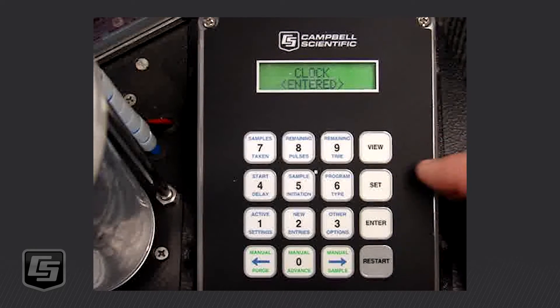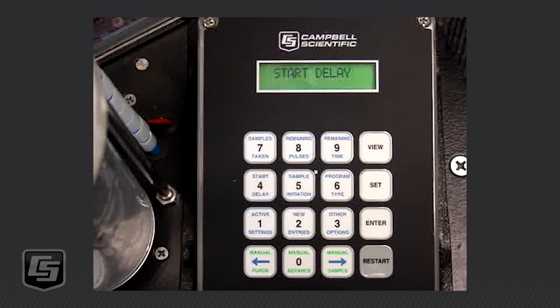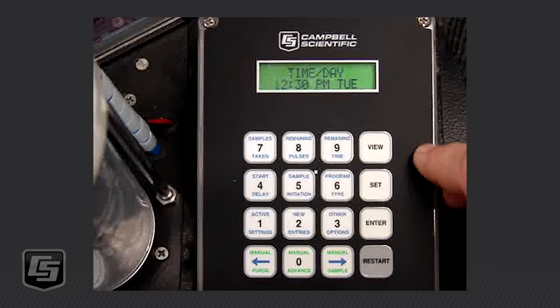Our clock is now set. Now we're going to set the program, so we push SET, Start Delay, number four. Mine has Time/Day already flashing, but let's scroll through with the left or right arrow to look at the other options. You can select a pulse input if you've got a flow meter, a pressure transducer, 4–20 milliamp (which could be a flow meter or other things), or an external contact if you have a water level sensor that you want to trigger the sampler.